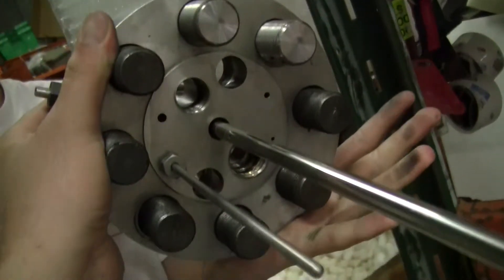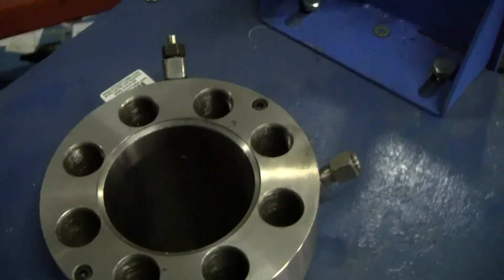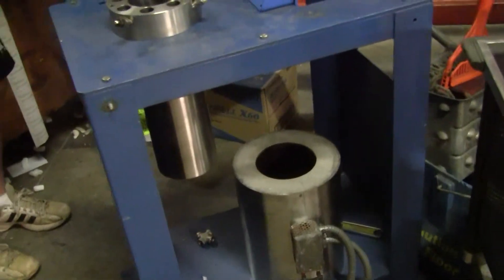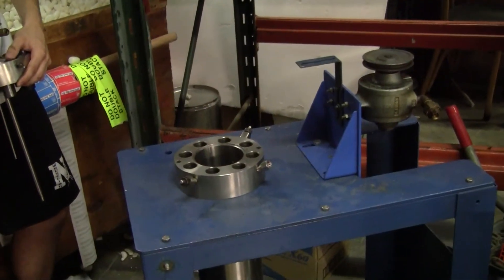Show me the bottom of that. Nice ports in and out, other side ports, lots of different access. The heater does work down below. We could build you the controller and temperature controller and that kind of stuff. Thank you from Hitech Trader.